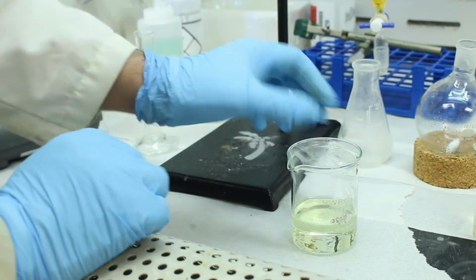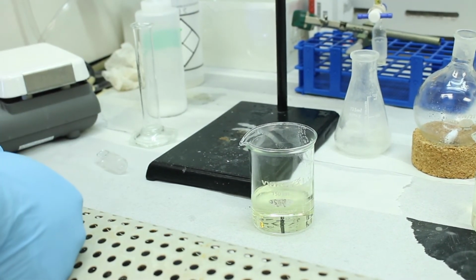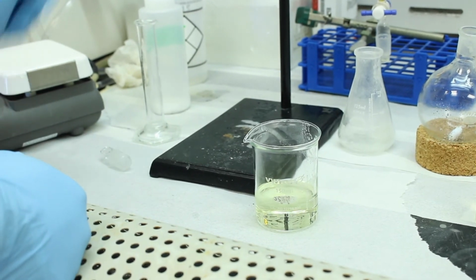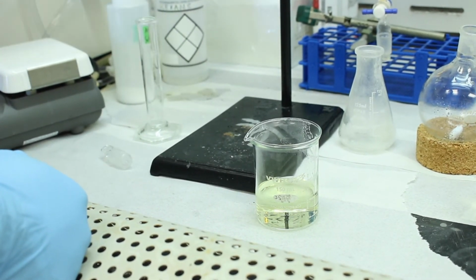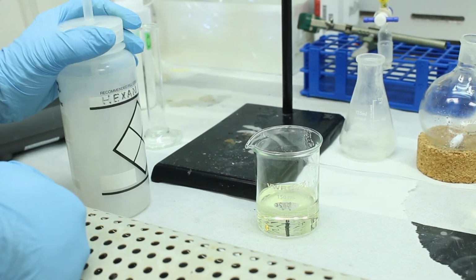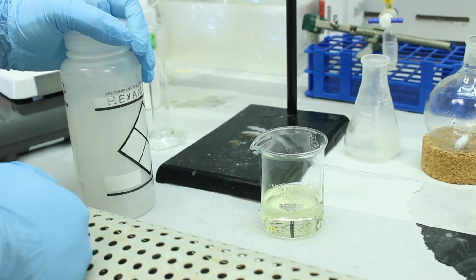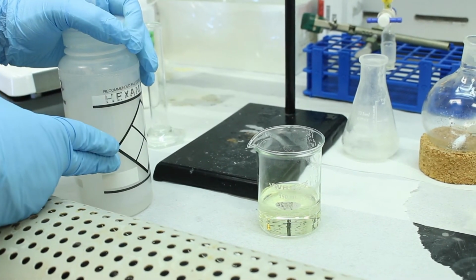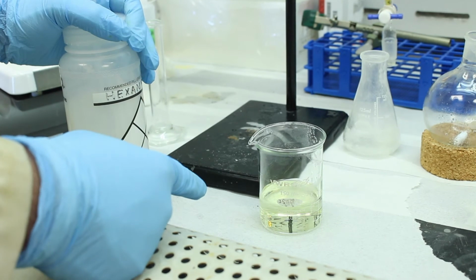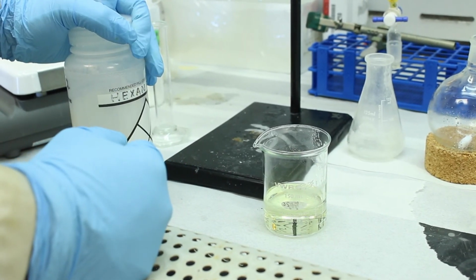Okay, so this yellow color, as I said, is probably from some residual biphenyl, the side product, which is colored yellow. To get rid of it, we're going to use a technique called trituration. Trituration is sort of like washing a solid, normally with a solvent that does not dissolve your target compound, but does dissolve the impurity. So it's kind of like recrystallization.